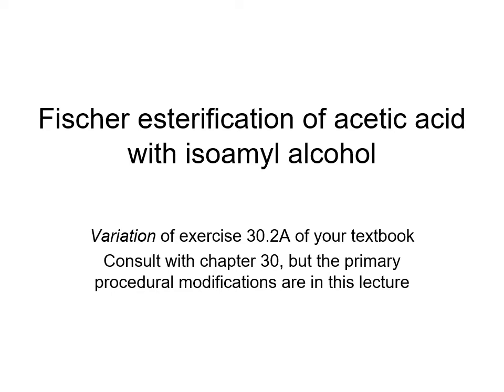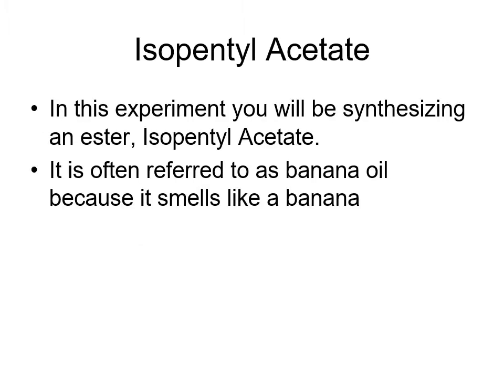In this lecture, we'll be covering another reaction. More specifically, we'll be covering the Fischer esterification of acetic acid with isoamyl alcohol. So this reaction involves creating isopentyl acetate.